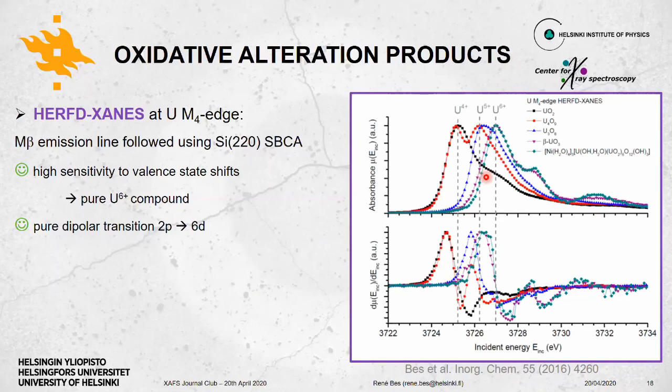They are not perfectly superimposed. This is still intriguing; we do not understand yet exactly why, but there is at least something happening for the 5f electrons due to the hybridization between the 5f, the 6d, and the oxygen 2p.